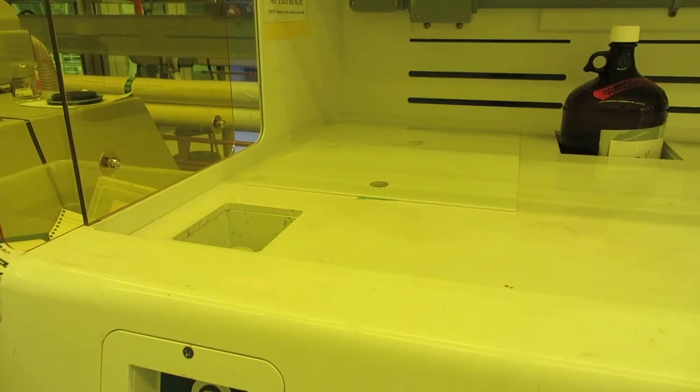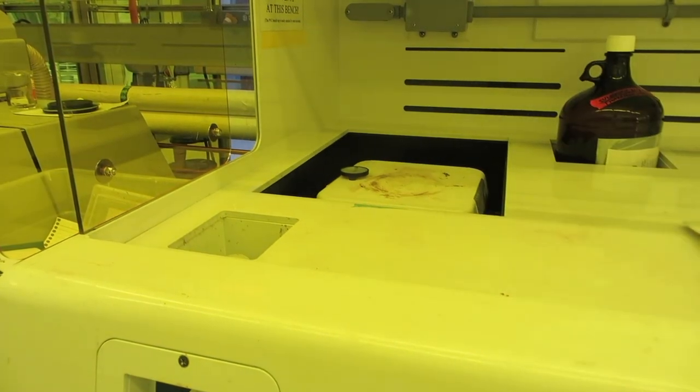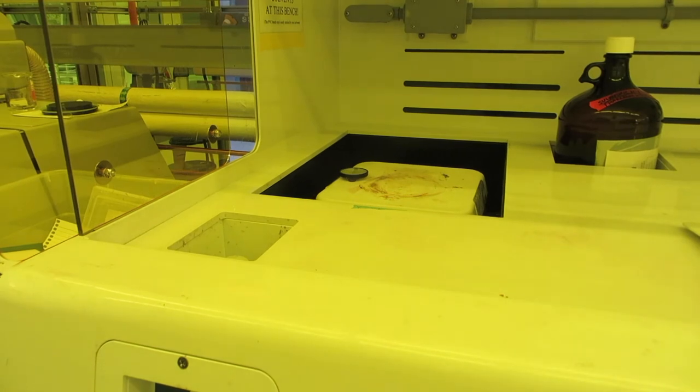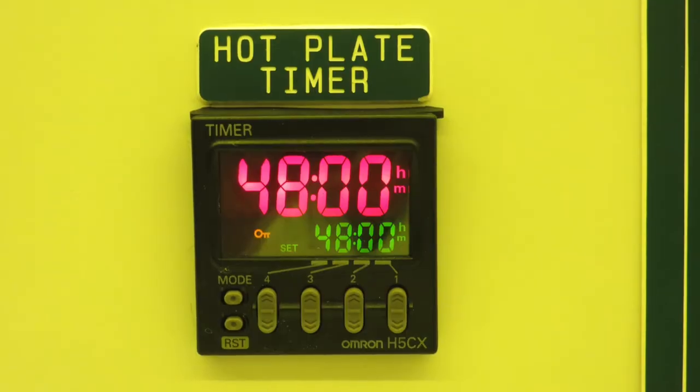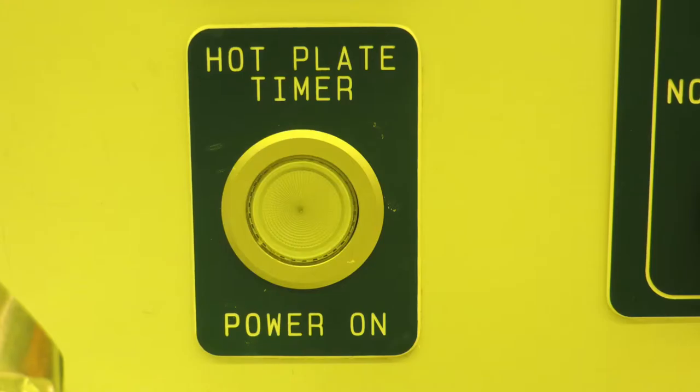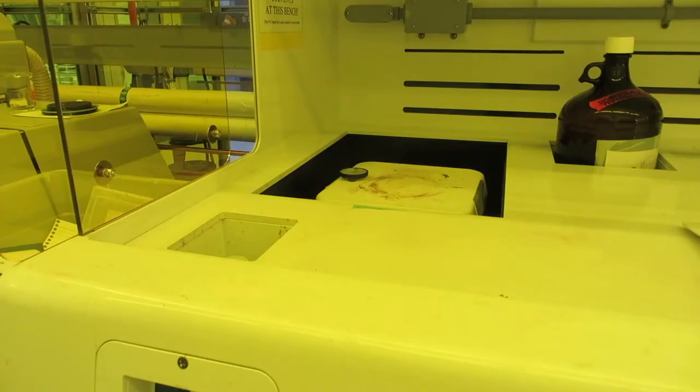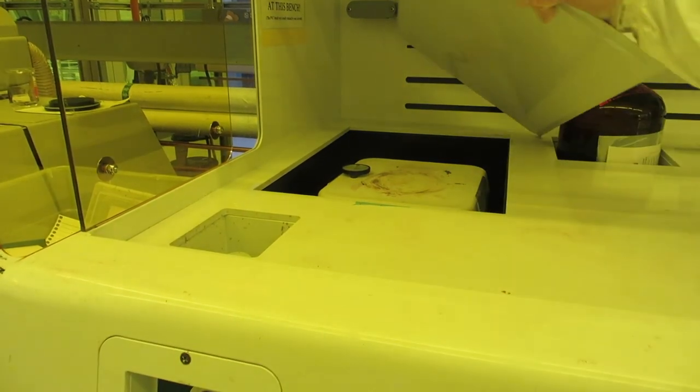There is a sunken magnetic spinner hot plate hidden under this panel in the corner of the bench. The power to this hot plate is on a timer. It was originally set to 8 hours, but because a few people were using it to do long electroplating jobs, we increased the setting to 48 hours. You need to push this button to start the timer before using the hot plate. The controls for the hot plate and spinner are on the hot plate itself. Make sure the hot plate is totally cooled down before replacing the cover.